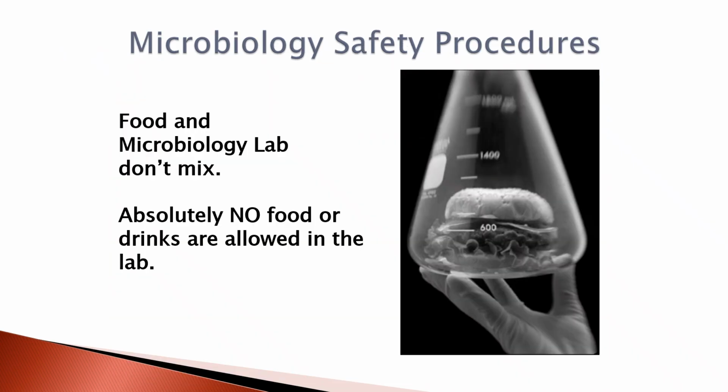Food and microbiology labs don't mix. As I mentioned earlier, absolutely no food or drinks are allowed in the lab, even if it is capped, even if it's in a container. Any of those things, you should never, ever, ever bring anything that's going to go into your mouth into the lab.